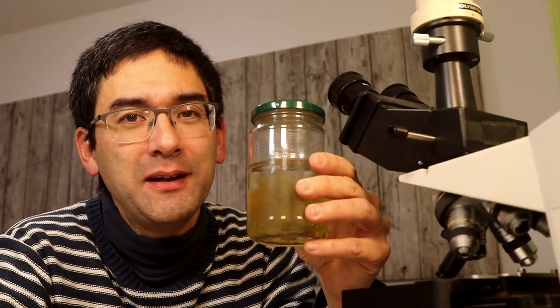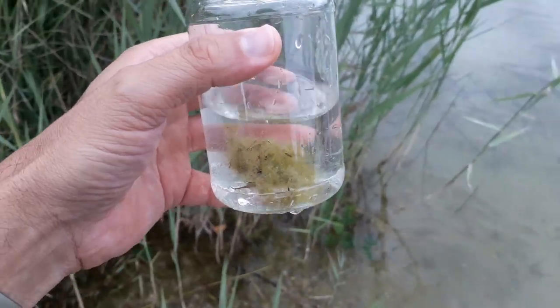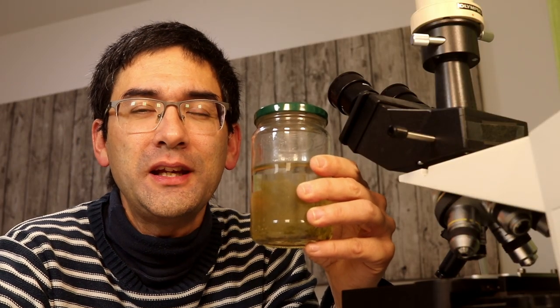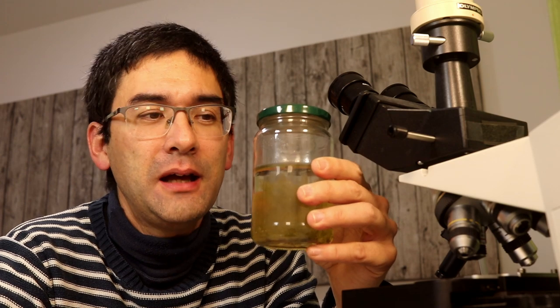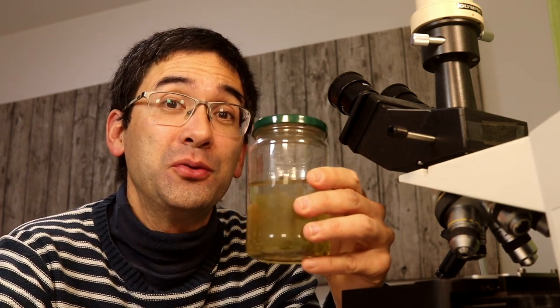I had it sitting around for around four months on my windowsill. I collected it back in August when it was quite warm outside, and the algae in here started to die off a little bit — they kind of lost their color already — but the mites, they reproduced. So maybe there were a couple of mite eggs in the water sample, and when I recently checked it there were a lot of mites, and I'm going to show them to you now.